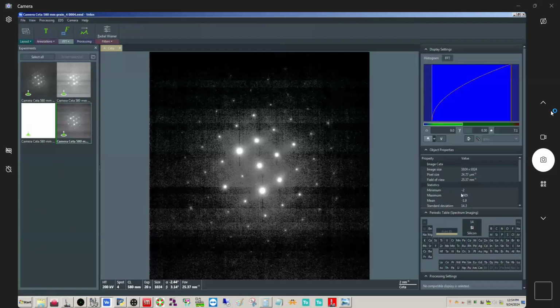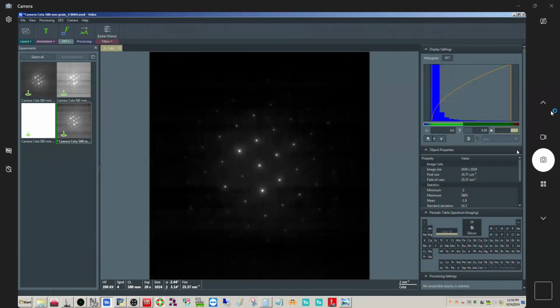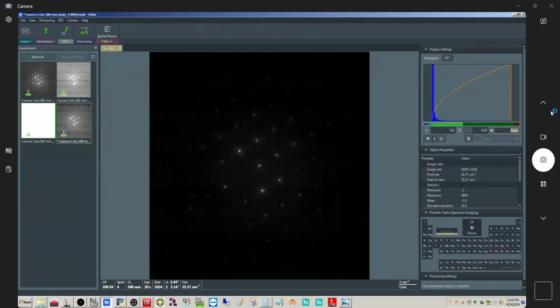Okay, and yeah, we're safe here. We didn't clip this at all. All right, so now we're going to have to do some digital fudging here to make this look better. So we can increase our white level, that's the first thing. If we drag this to the right here, and now I can just manually increase this. Okay, I have nice tight spots here.